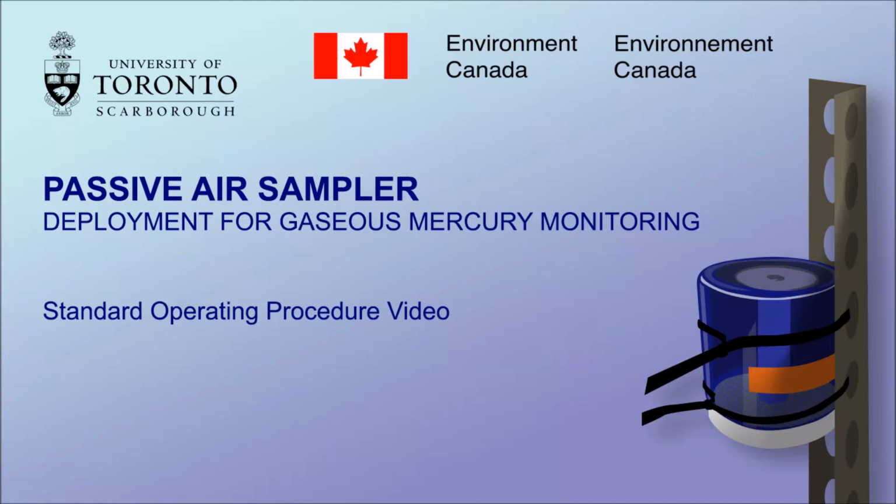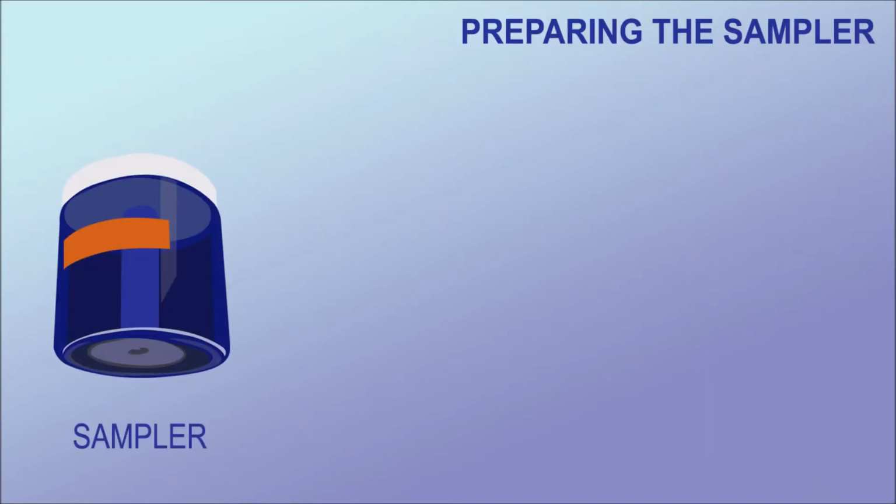In this video, you will observe how to deploy a passive air sampler for gaseous mercury monitoring. Preparing the sampler. This is the sampler.